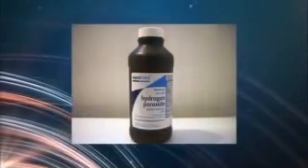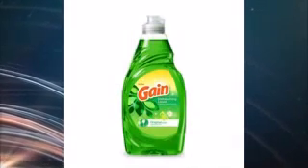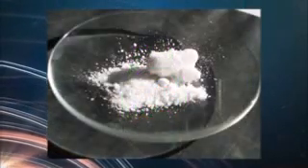For each of the two experiments, 20 ml of hydrogen peroxide and approximately 5 ml of wet washing detergent was added to 53.6067 grams of potassium iodide in a measuring cylinder. For each experiment, the potassium iodide acts as the catalyst.